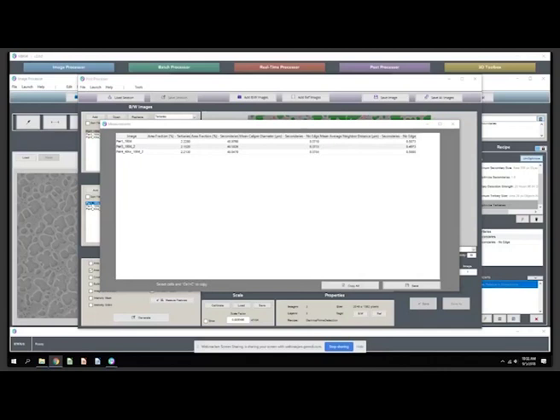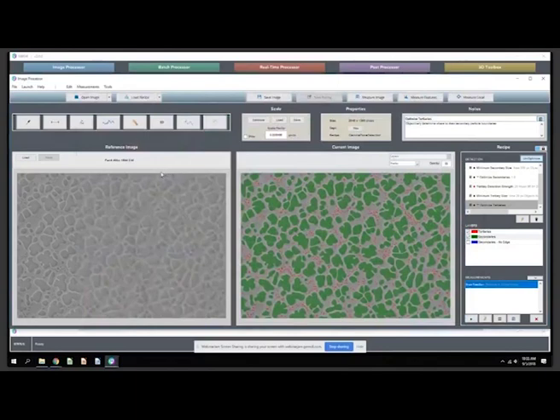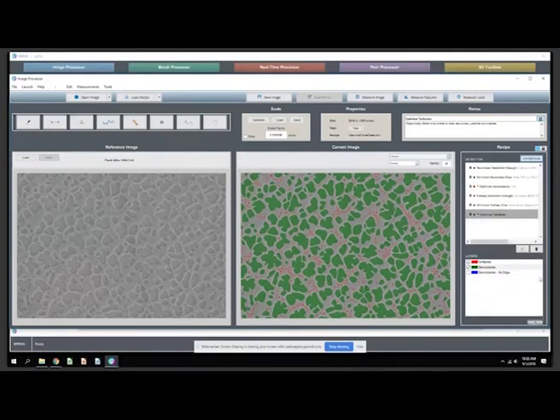Thomas has asked if we can get an idea of the complexity of the recipe, and absolutely, Thomas. As you'll see, our product caters to both the one-click, one-drag users that need recipes built for them, as well as image analysis experts that have come up through the ranks of Fiji and Python and are looking for an environment in which they can unleash their skills more interactively, more quickly, more non-destructively. And that's what you'll find with the recipe technology.